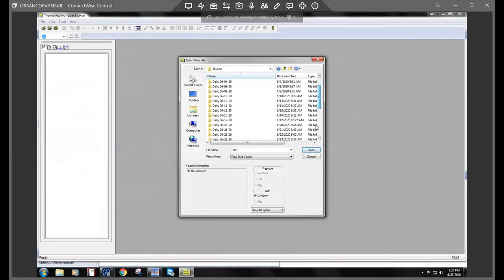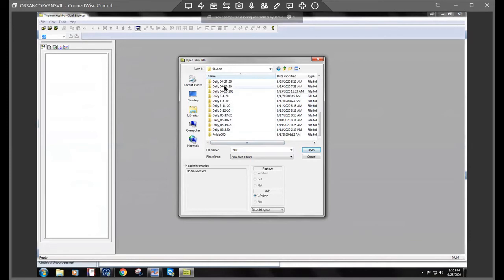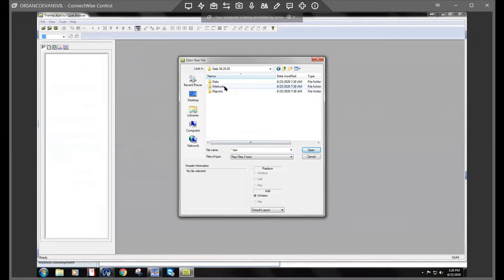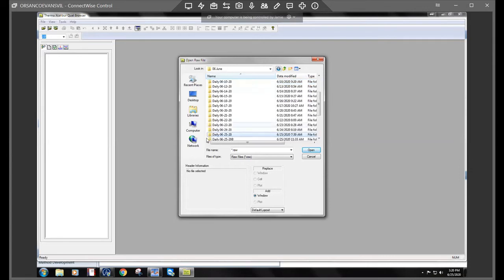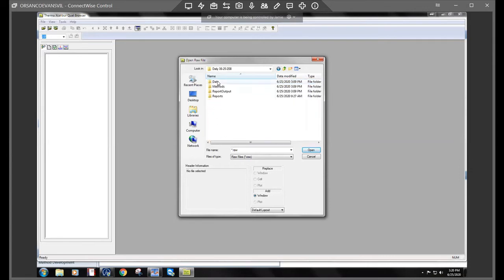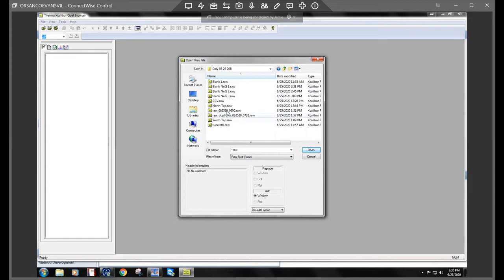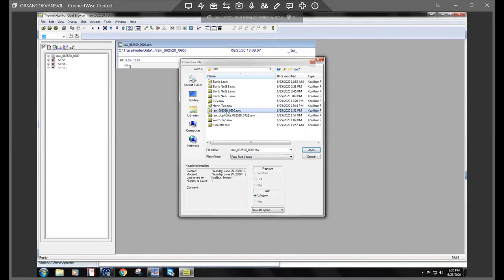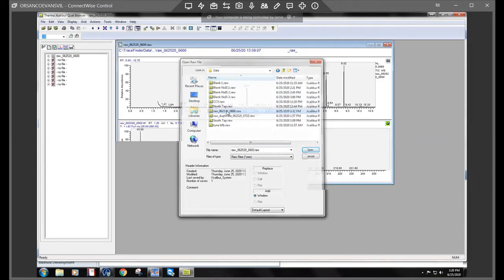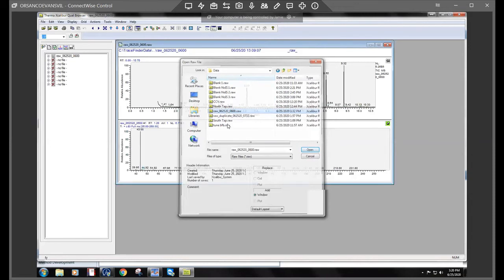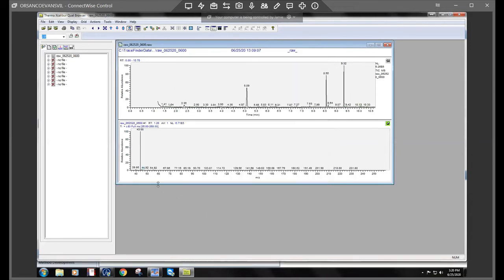And this was on the 25th, this one here. Oh, sorry. Maybe we ran it twice. Okay. So there's our raw file. So we'll pull that up.